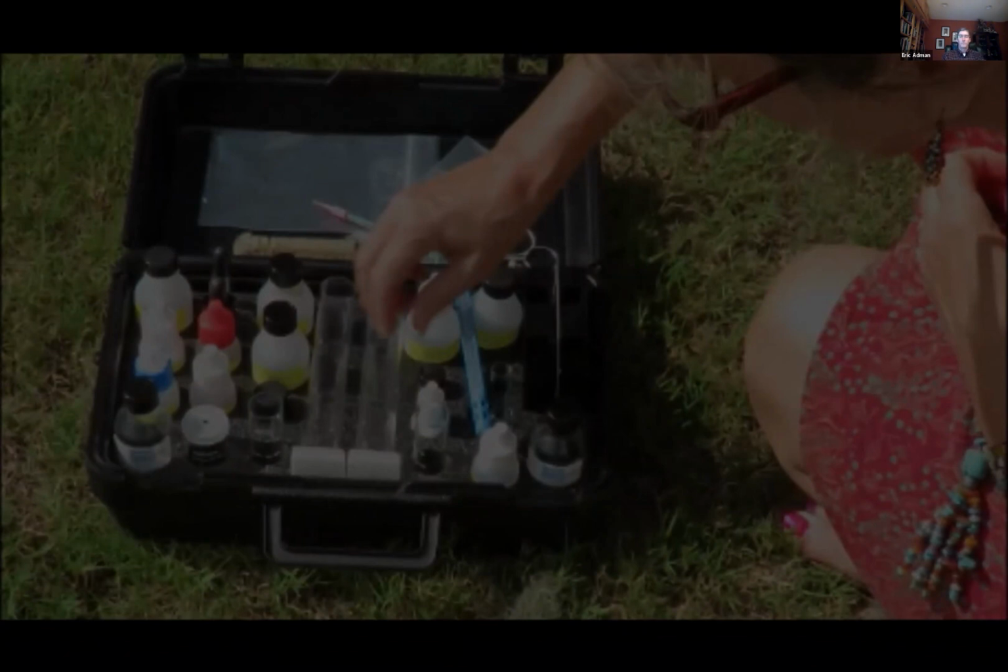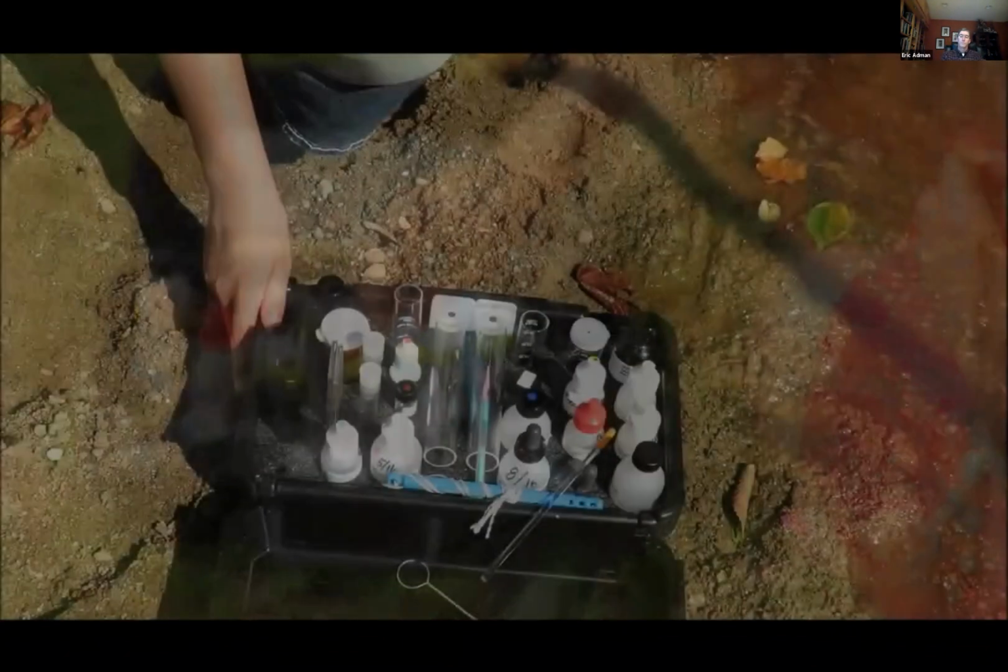Some of the reagents used for this step are hazardous. Children using these chemicals should be carefully supervised. Make yourself aware of and adhere to the recommended Alabama Water Watch safety protocols. Also remember to hold reagent bottles vertically to ensure uniform size drops.